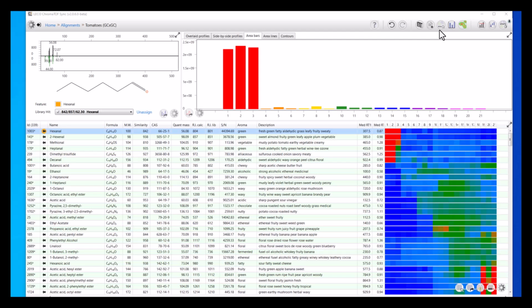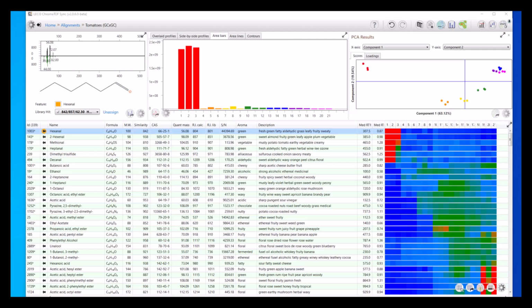We can also perform additional comparisons with this compiled data, like principal component analysis. Here in the scores plot, we see some of the overall trends between the samples and which are more similar to each other. The fresh samples are separated more on PC1 from the later time points. This suggests that they are more chemically distinct and that many changes likely occurred early in this process on that first day. We also see that the other samples move along PC1 in time order, with the samples collected after 1, 2, and 3 days grouping independently, and then the last 3 days all clustering together.